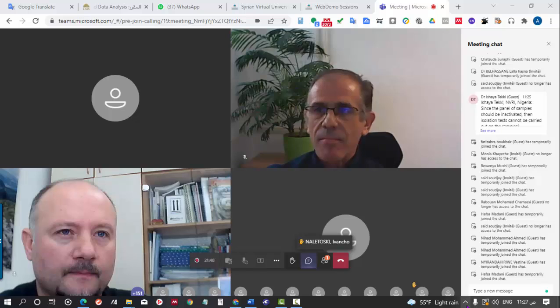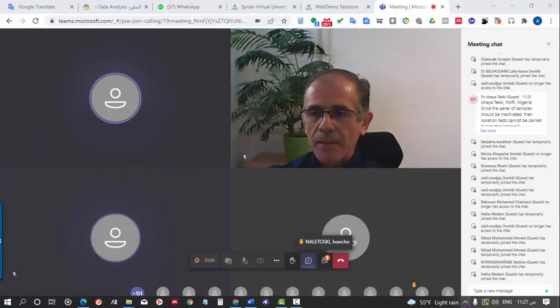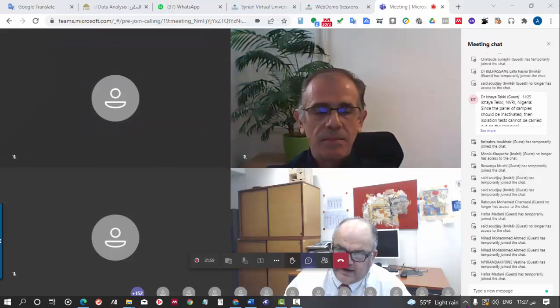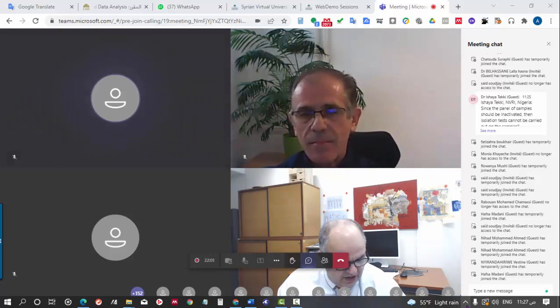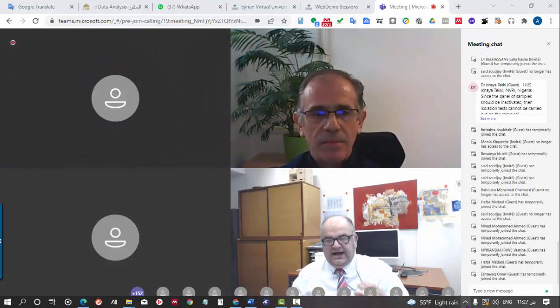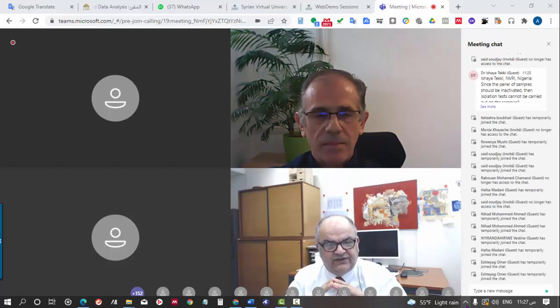Thank you, Igor. One more question from Dr. Teki, Nigeria. Yes, sorry, Ivancho. Artem, I just wanted to complement this question. All we were talking about the whole week, including participation in ring trials or proficiency tests, is part of the process of harmonization.